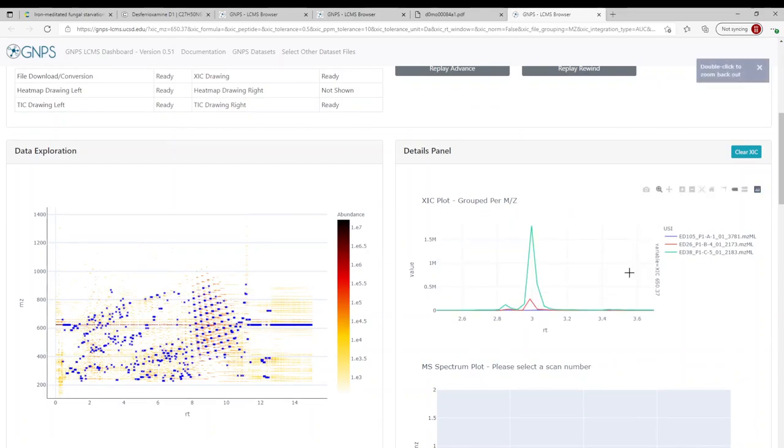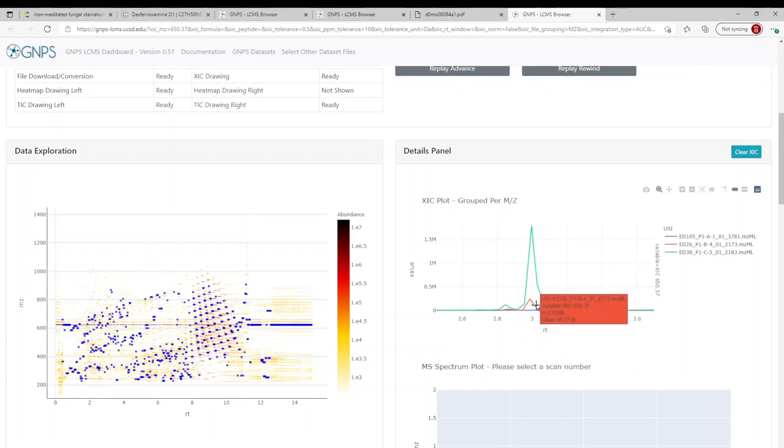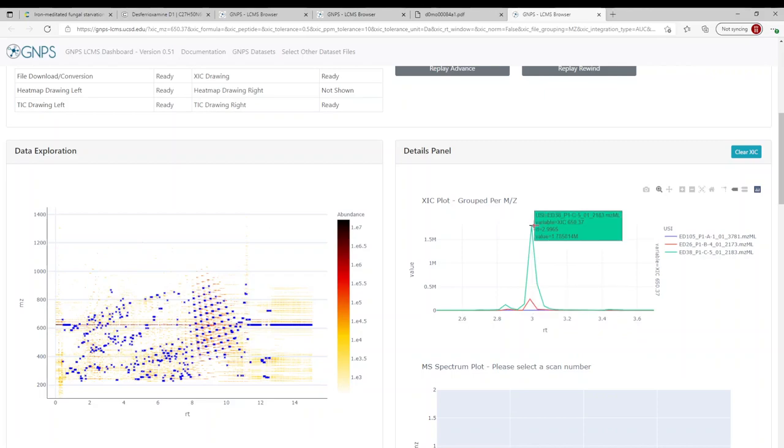we can very clearly see that it is only produced in co-culture conditions, and it's potentially produced significantly greater in the co-culture with Botrytis cinerea.